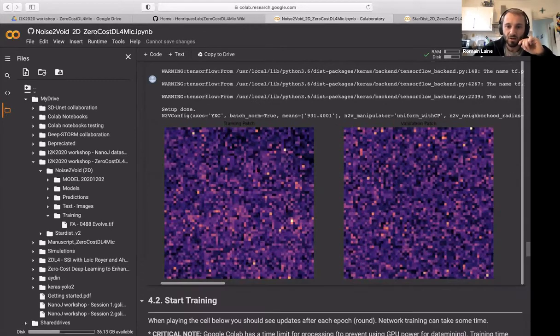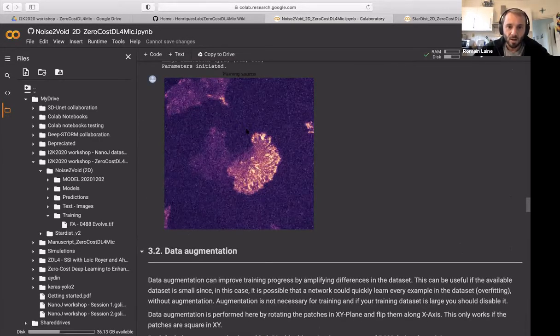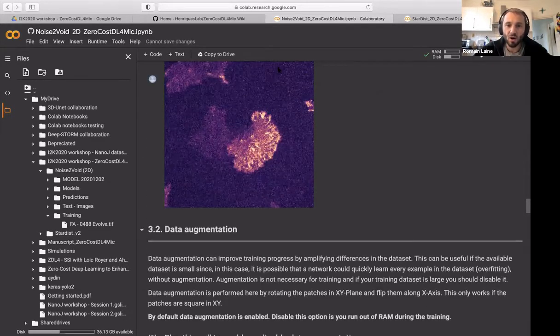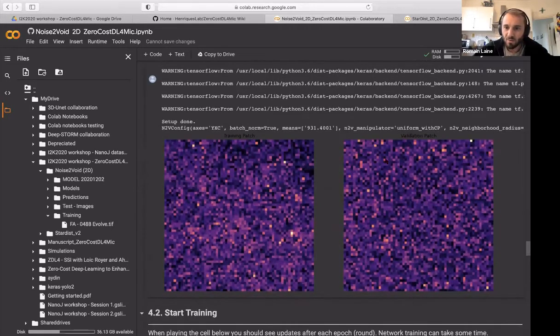And so we can take a look at individual patches. And if I go back up to the original image, the patch that we've got right here is actually a small subsection of this image here. And because a lot of noise is present in here, unluckily for this run, we're showing a random patch out of the hundreds and hundreds of patches it's created, a random patch that will have only been located in the noise. But that isn't a big issue.